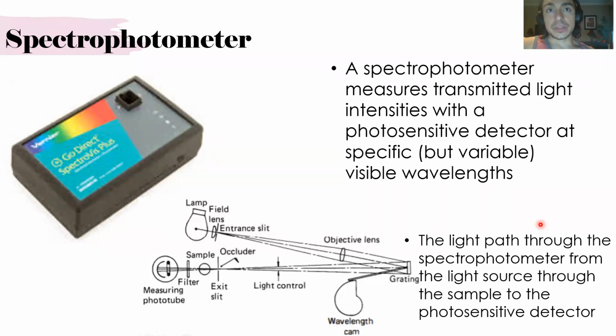All right, so we said that the degree of absorbed radiation is measured using an instrument called a spectrophotometer, which measures transmitted light intensities. The wavelength where the absorbing ions or molecules have a maximum absorbance of visible radiation is determined first and then set on the spectrophotometer for the analysis.